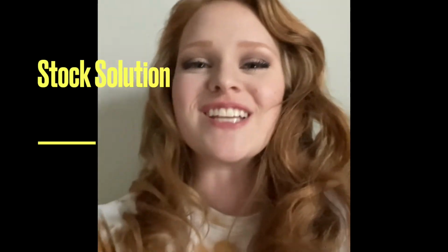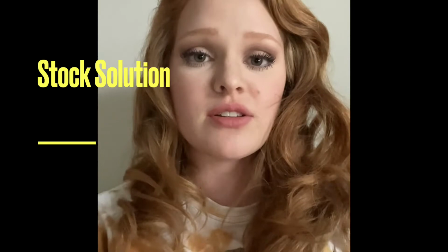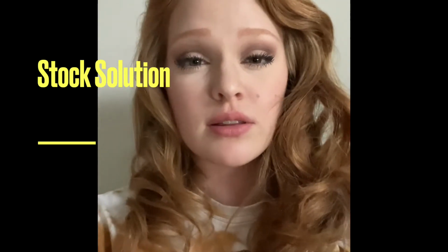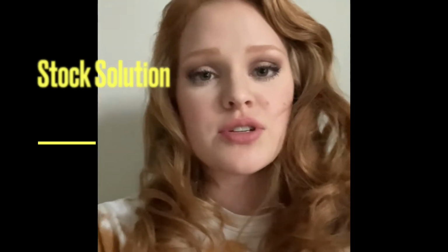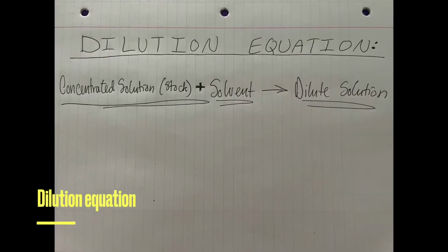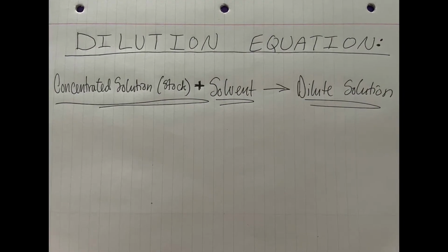Challenge 2, we are using stock solutions. Stock solutions are a very concentrated form of a solution. It is done that way so stuff can be stored. But if you need a lower concentrated solution, you can mix a solvent with it to get that dilute solution. Dilution is the process of reducing the concentration of a solute in solution by mixing it with more solvent. Here is the dilution equation. You add a concentrated stock solution plus a solvent and get a dilute solution.